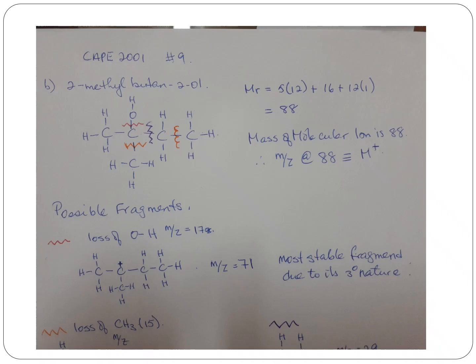I prefer to go the other way, and this is one of the ways that you can approach as well, by simply looking at the molecule and not necessarily doing the math. So if I look at that red squiggle at the top, that red squiggle is formed by the breaking of the bond where I lose the OH, which will have a mass-to-charge ratio of 17. Losing my OH results in me then having a mass-to-charge ratio of 71. And that would be where my carbon now has a positive charge. So this is now the positive fragment, where the carbon is going to be positively charged.